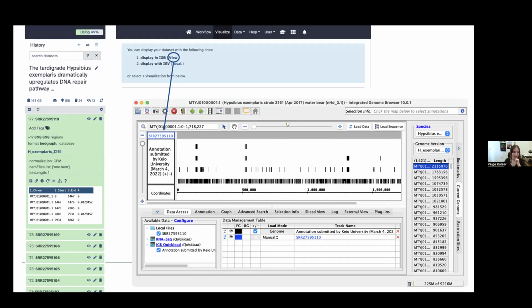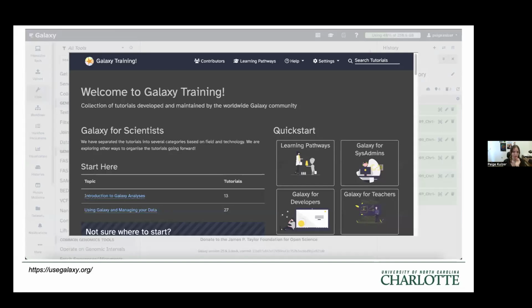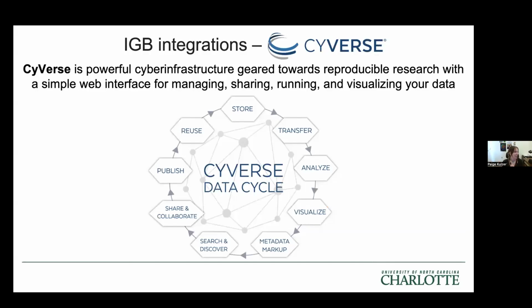So yeah, it's a very wonderful tool. And they have a really responsive team. They also have a lot of training materials on there. So it's not just how to get started with Galaxy, it's how to get started with specific analyses. So if you're new to single cell sequencing and you don't know how to get started analyzing a data set, they have probably got a training or three for you. So I would highly recommend.